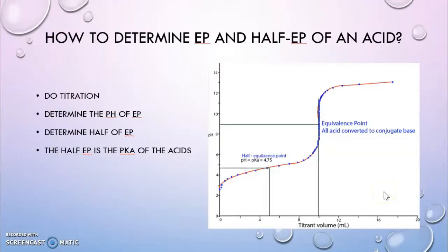pKa could also be determined by looking at the titration curve. Half of the equivalence point is where you can find the pKa value.